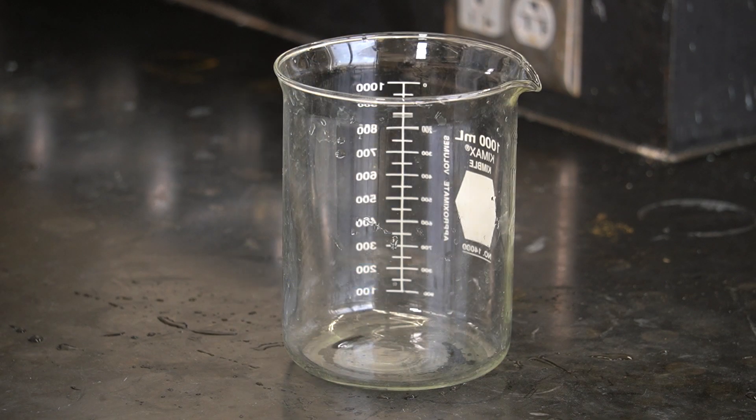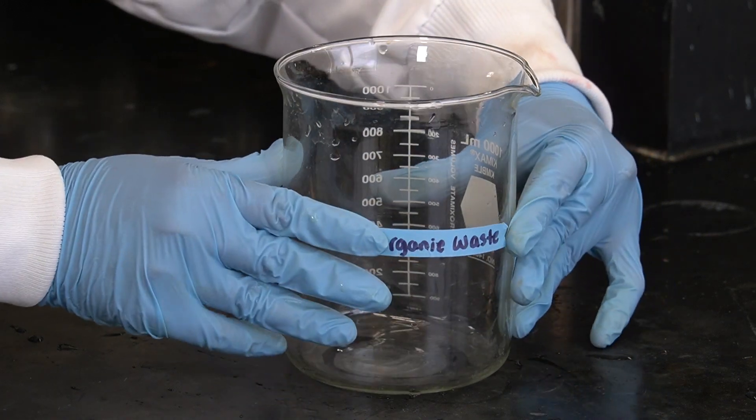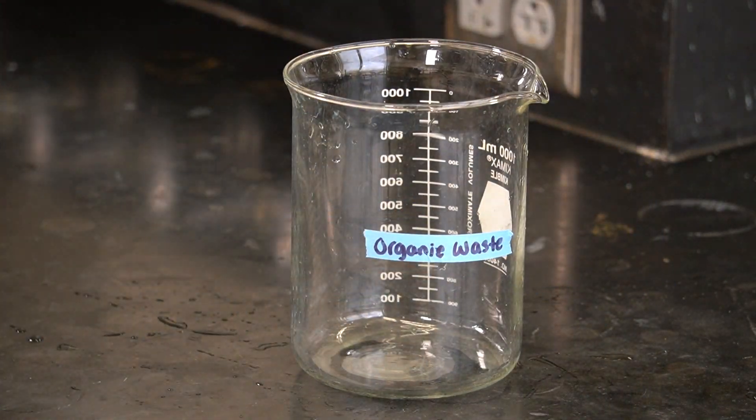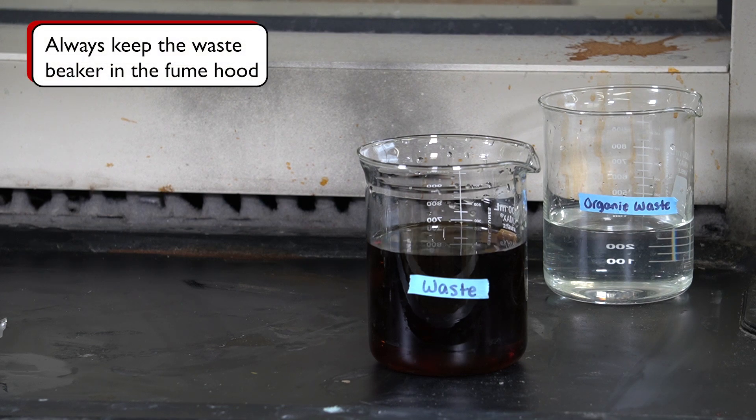However, if it is used for other types of waste, such as organic waste, we should mark it clearly as organic waste. In general, it is a good idea to label any container in the lab so we know exactly what it contains and can handle it properly. One note: we should always keep the waste beaker in the fume hood, especially when it contains organic solvents which can be volatile.